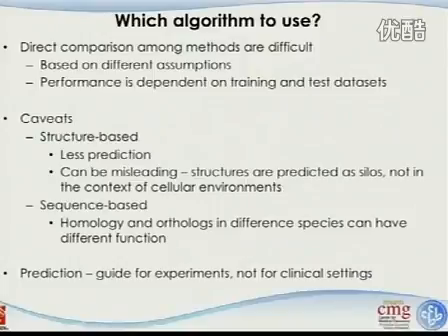So it still comes to the question of which algorithm to use. And it's really, really hard to say. Different algorithms have different assumptions. But probably because of this, you want to try different things. Maybe some algorithm is good for one type of assumption and others are for another type of assumption. So you can use multiple algorithms to predict things, and they may each pick up different things. So which is really fine. Okay.